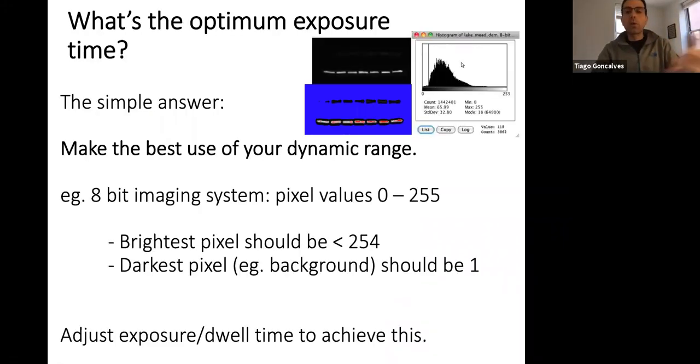Now, this is a problem very similar to taking photos with your camera. You have a camera, you're at the microscope, whether in vivo or not, or it's just the camera on your cell phone at a party. What's the optimal exposure time? How long should you expose your sample for? If you're at a party, the phone decides this for you. But you know that very often, in a really low light situation at night, your image is not good. A, it's blurry because your exposure time was too long, so the image moved while you were exposing. Or B, you've accumulated a ton of noise, and you can tell who's there, but it's a horrible image with a ton of noise.